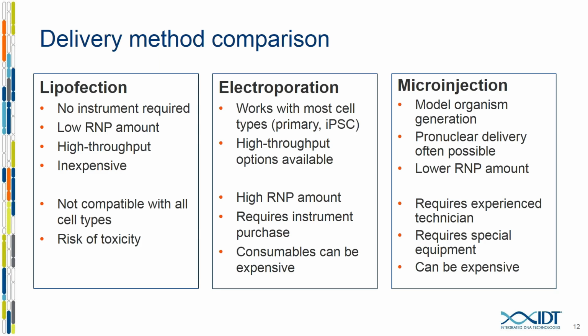types. Of course, you have to have the electroporator to begin with, so that initial investment exists unless you have hopefully a lab nearby that might let you borrow their instrument for the day. And the consumables can start to add up as well. So those are some of the cons to the electroporation option.